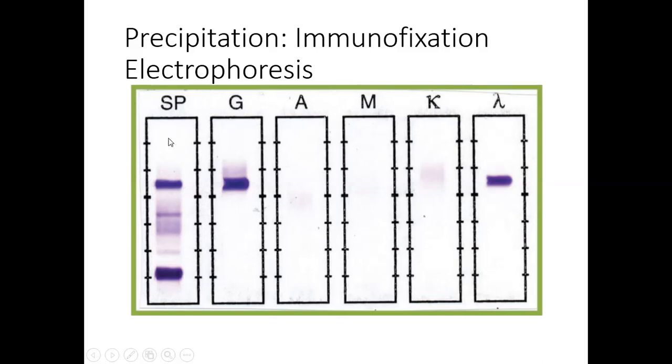So we're going to put antibody here, antibody here, antibody here, antibody here, antibody here, antibody here. And they're going to be different ones. So we actually have like 6 little individual gels here. Getting ahead of myself. So we have added 5 known antibodies.